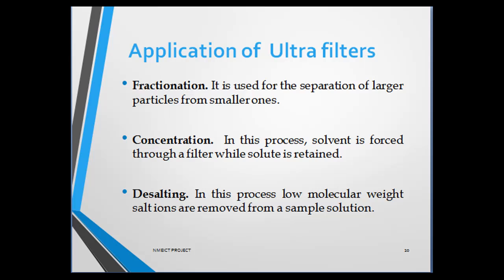The third application is desalting. In this process, low molecular weight salt ions are removed from a sample solution. Ultrafiltration is a simple method to remove salt because salt ions readily penetrate the membrane, thus leaving the solute of interest on the membrane surface. Ultrafilters are also ideal for the removal or exchange of sugar and non-aqueous solvents, the separation of protein-bound ligands, the removal of material of low molecular weight, or the rapid change of the ionic or pH environment.